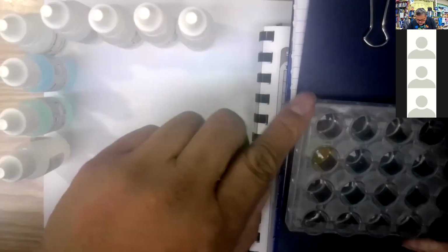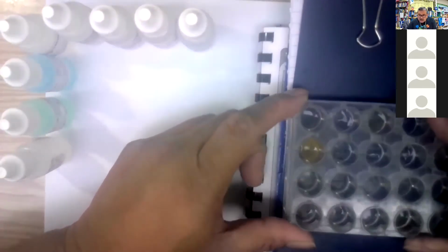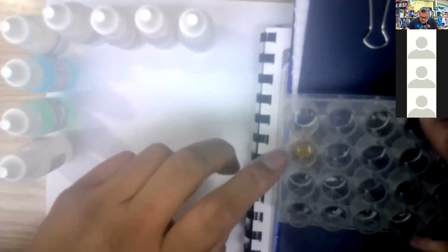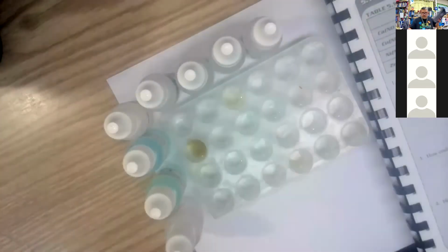And do I see any chunks? I'm going to put my glasses on. And I really don't see any chunks in this row. I do see a distinct color change there. It looks like an orange color.